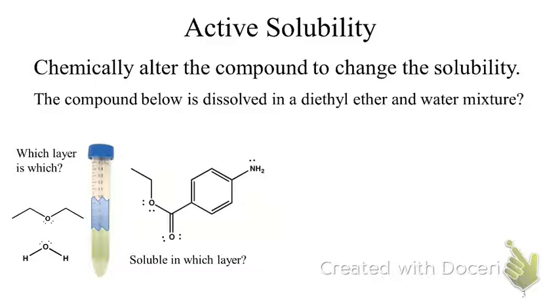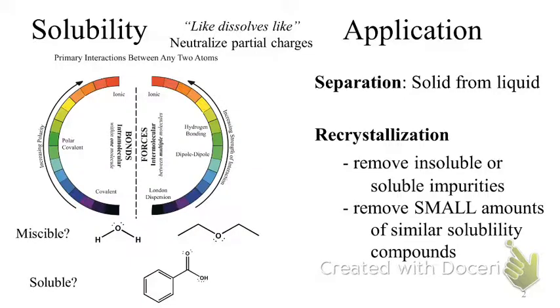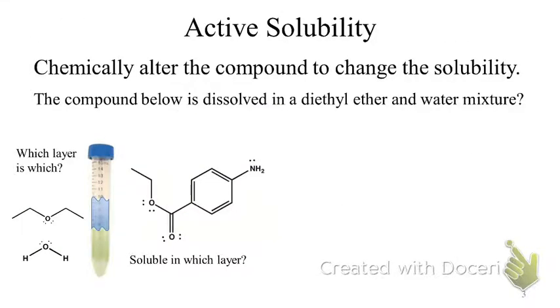So you'll take this 15 mil centrifuge tube and you're going to add diethyl ether to it and water. Okay, should those mix? We can go backwards. Should those mix? No. Okay. Which layer would we expect to be on top? Okay, so we're hearing all sorts of answers. What should we be looking at to figure out which layer should be on top? The densities. So it doesn't matter if it's organic, inorganic, blue, yellow, green, black, whatever you want to call it. It only comes down to the densities.